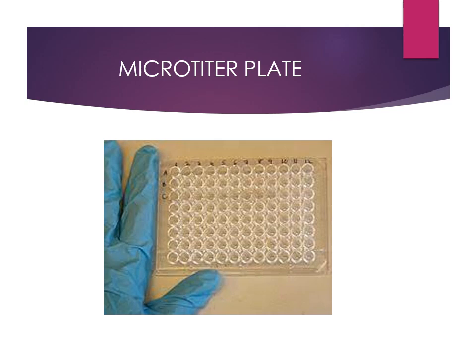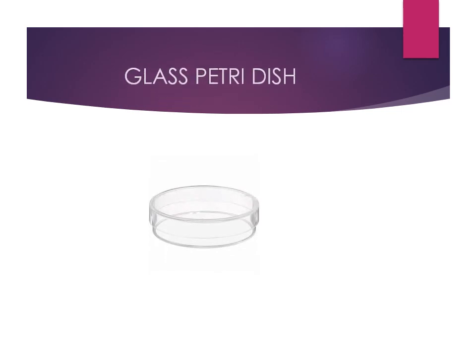Now we come to the next spot. So this is a Petri dish. Whenever your examiner provides you a Petri dish, kindly take it up and check what the material is, whether it is a glass Petri dish or a plastic Petri dish. Usually the plastic Petri dishes are disposable and we cannot reuse them. But most of the labs in the older institutes prefer the glass Petri dish because you can reuse it and you don't waste resources. So this is a glass Petri dish, and the next question is: how can you sterilize it?